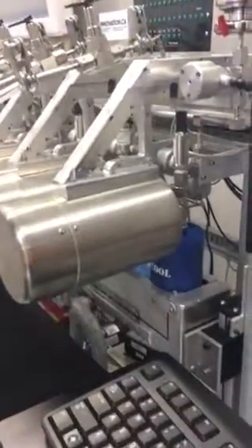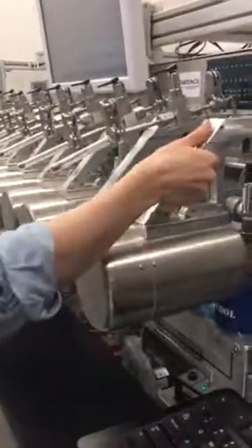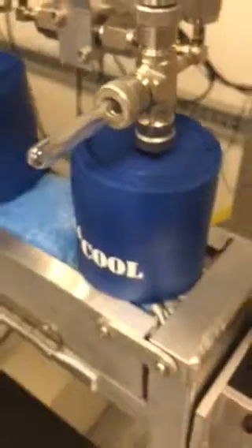We freeze the CO2 and add hydrogen. So your reaction is CO2 plus hydrogen gas. Then we add heat over iron powder. So if we pull this oven off, this is actually running right now, you can see iron powder, which is normally gray, has turned black. And that's your graphitizing sample. So that's your final sample of carbon.